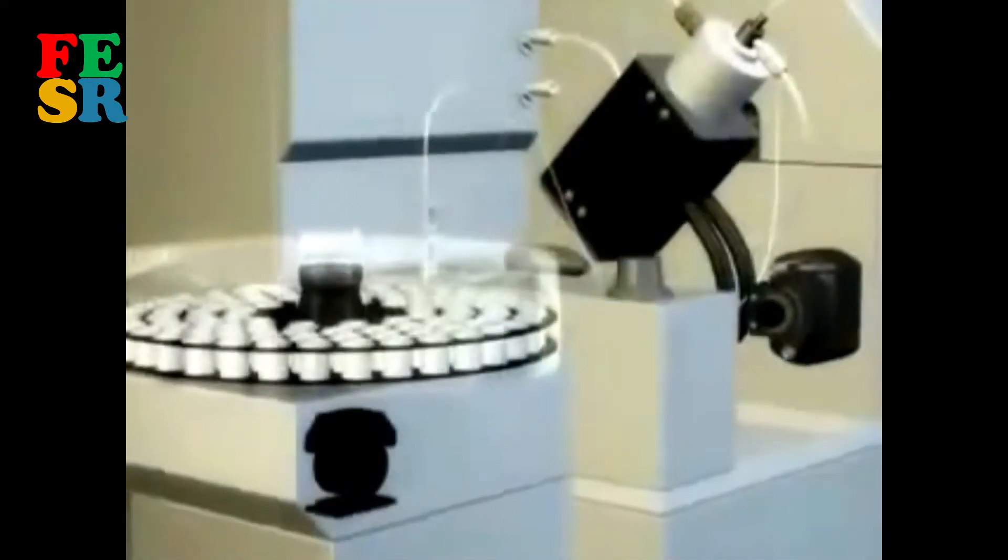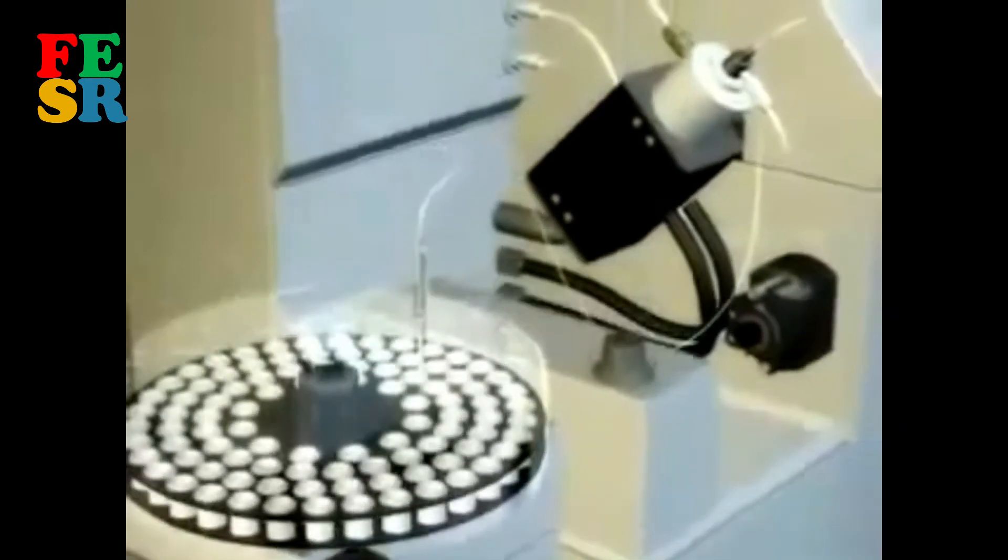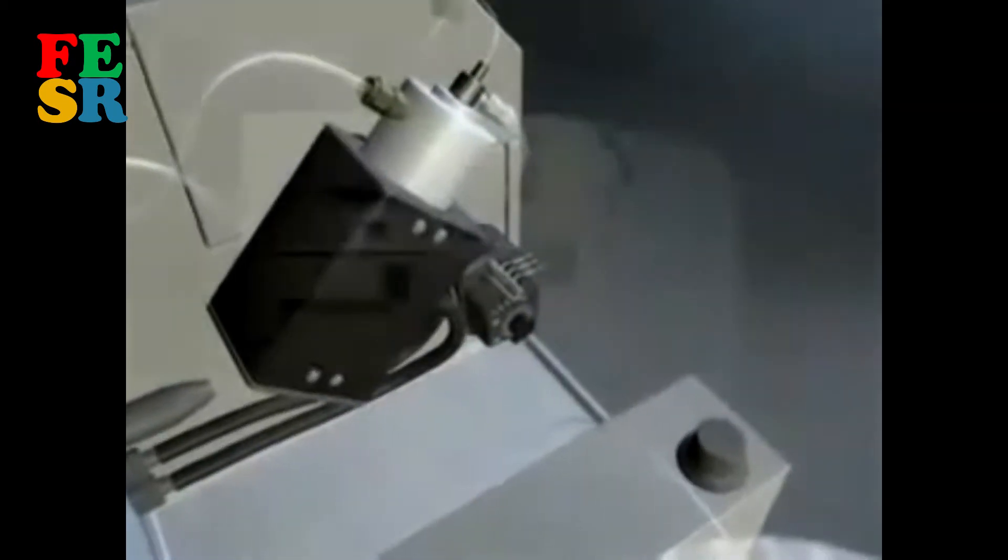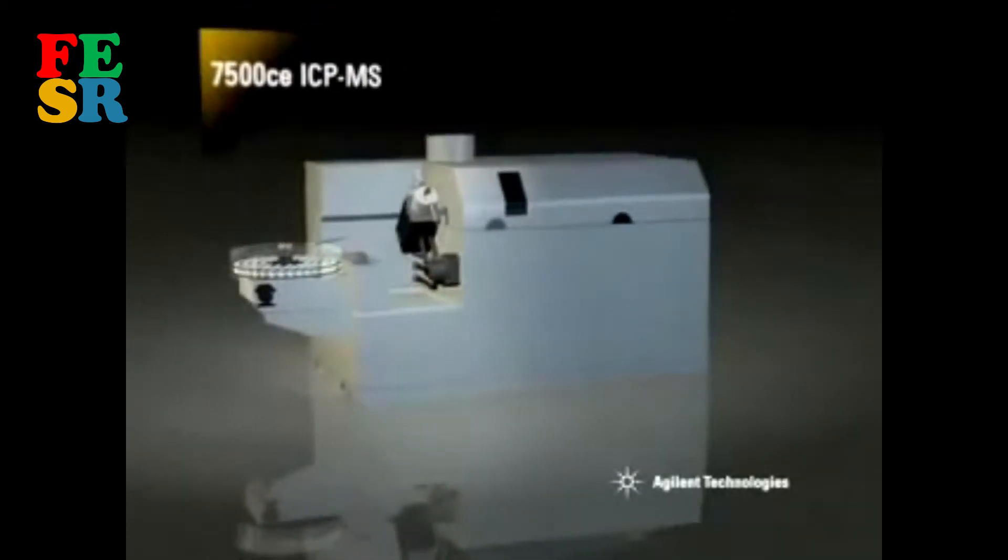The Agilent 7500 CE Benchtop ICP-MS with Octopole Reaction System Technology is revolutionizing ICP-MS. Its unique Octopole Reaction System removes spectral interferences, allowing ultratrace measurement over the widest elemental range, even in the most complex and challenging sample types.